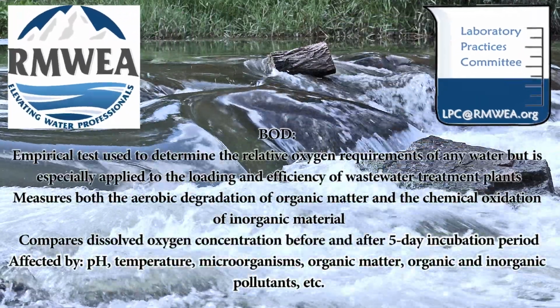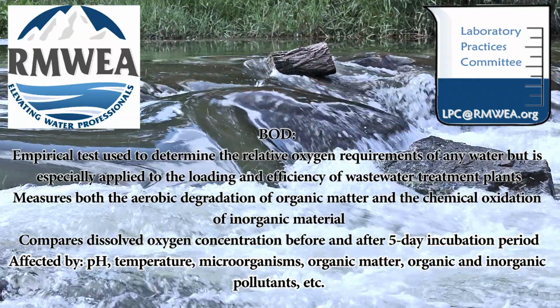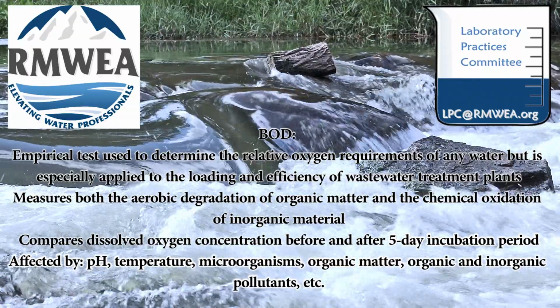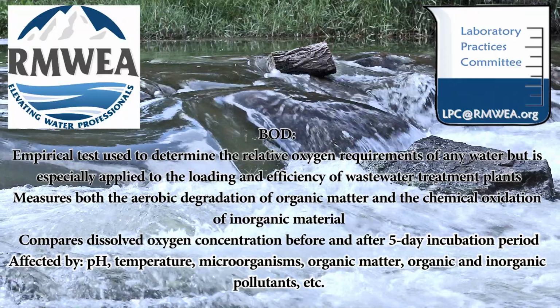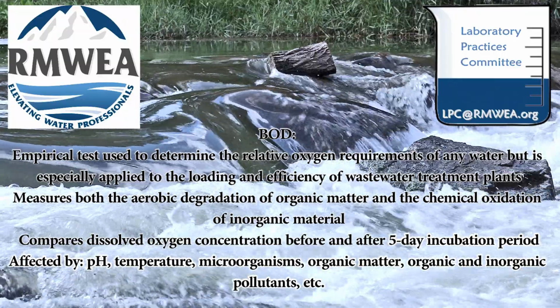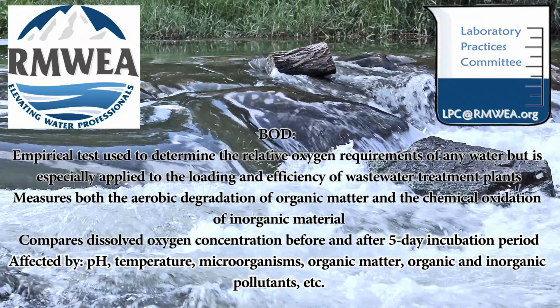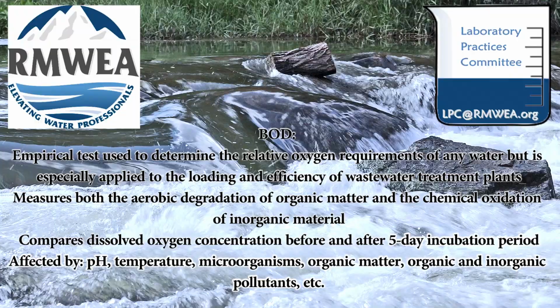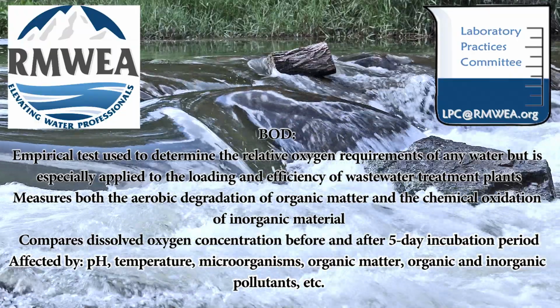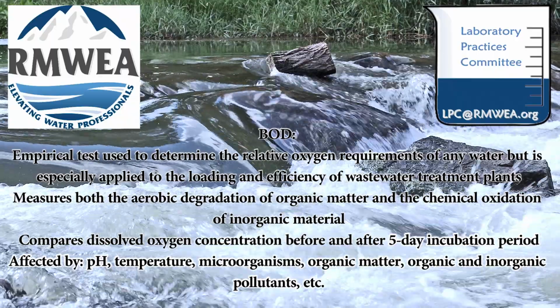According to Standard Methods, biochemical oxygen demand is an empirical test used to determine the relative oxygen requirements of any water, but is especially applied to the loading and efficiency of wastewater treatment plants. BOD measures both the aerobic degradation of organic matter and the chemical oxidation of inorganic material. BOD is measured by comparing the dissolved oxygen concentration of water before and after a 5-day incubation period.